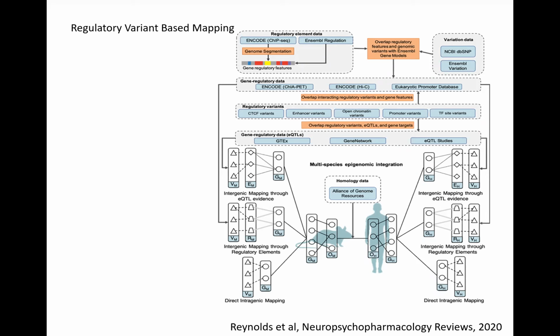And now we can ask which non-coding variants are predicted to have the same effects on those targets. And so we can actually start aligning functional genomic studies in one species to variant mapping studies in another species. So you might say, well, are there mouse genes or mouse variants affected by the variants I've identified in a human GWAS? And when you pull those data, I'm asking a question about a single variant, but you can actually do this comparison globally.